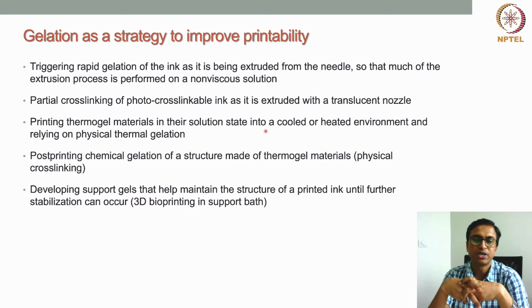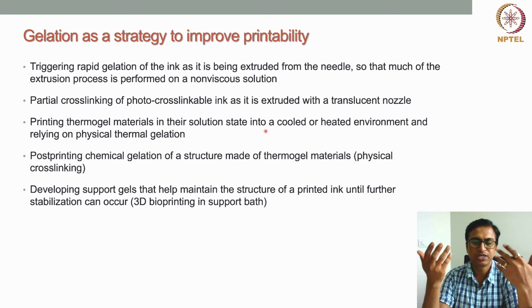After printing, we know that thermal gelation cannot provide long-term stability. After a certain time, the material can get deformed.